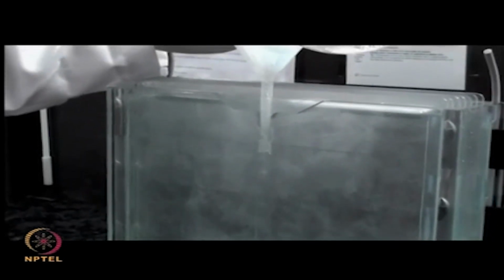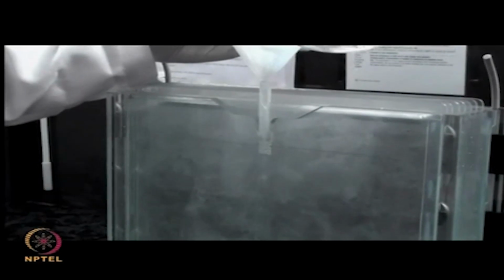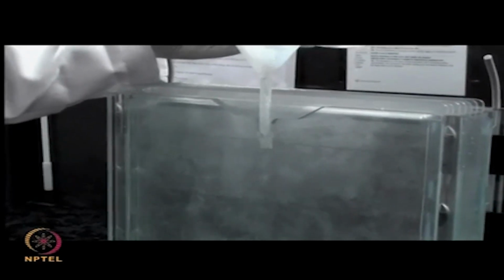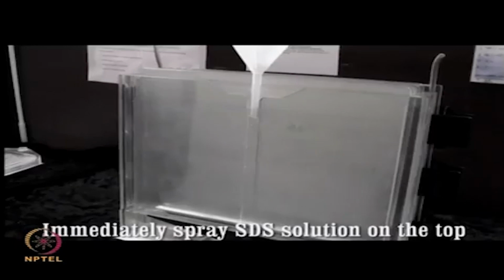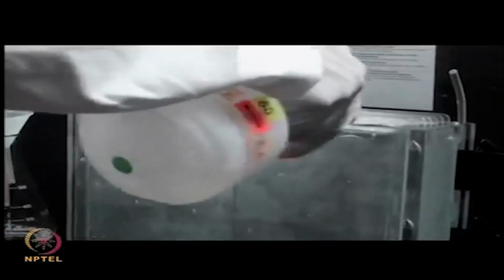APS acts as a free radical generator while TEMED functions as a catalyst for the polymerization reaction. Ensure that the solution spreads evenly such that the top edge of the gel is uniform. Allow the solution to stand for polymerization to occur and spray a solution of SDS across the top to ensure that the gel does not become dry.